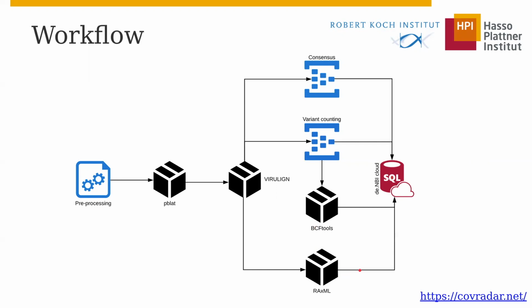You can stop here and use our in-house scripts to analyze the results, or you can decide to upload them to a MySQL database to access them via the app.